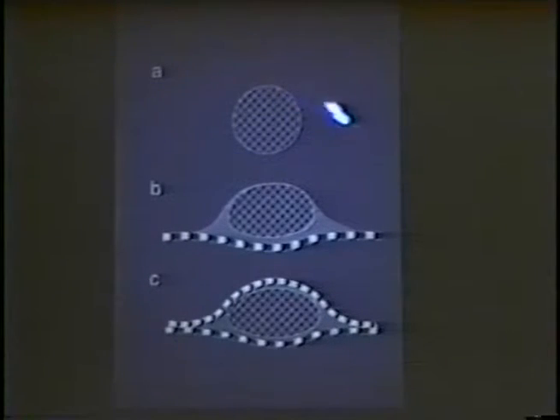Here we have a biological particle, a protein. Example B, the protein is supported on the carbon film, producing some distortion and some slight flattening of the protein molecule by the surface tension of the surrounding stain. Example C, a double layer of carbon with a thin layer of stain trapped between the carbon films and around the protein molecule. There may well be an even greater amount of molecular compression and protein distortion.